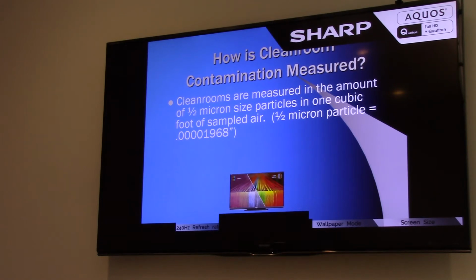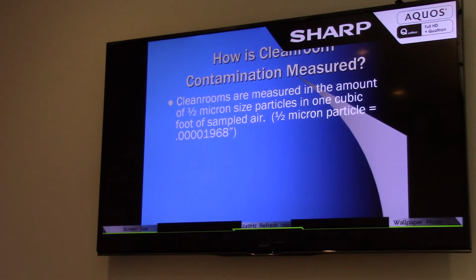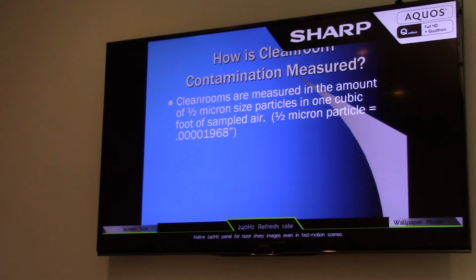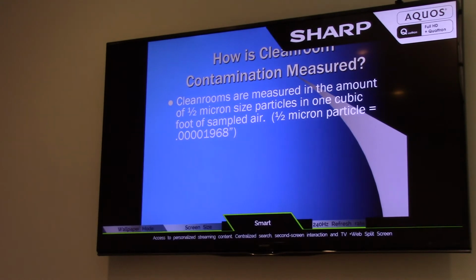And what you'll also see on this clean room is there's a control panel on the outside that's continuously monitoring the space at a specific point for each of the 2 rooms. Now, in our case, on this particular clean room, the first room you walk in from the entry is a class 1000 clean room, so no more than 1000 particles. Then you have the second space as you go through the second airlock, and then you'll be entering a class 100 space.